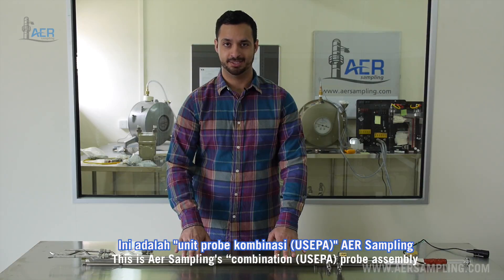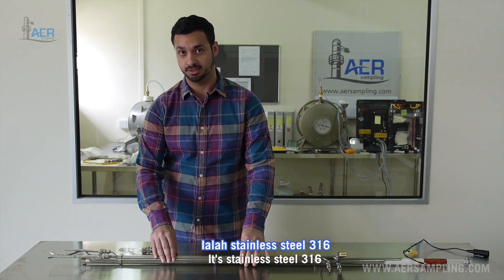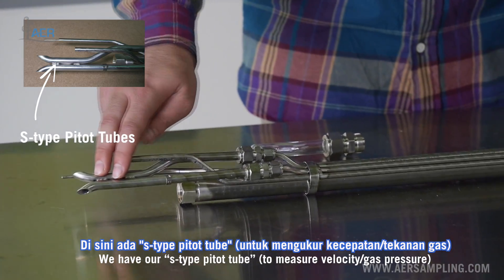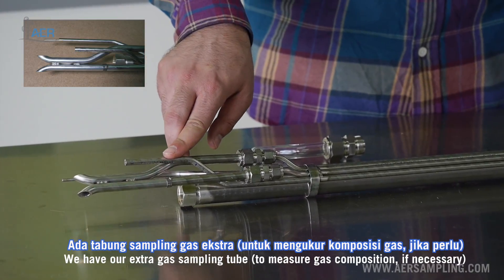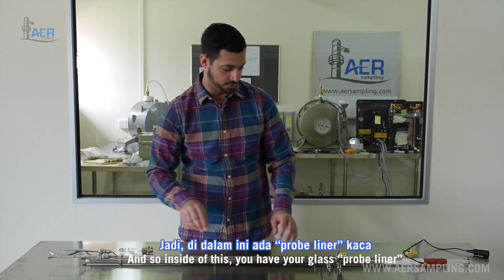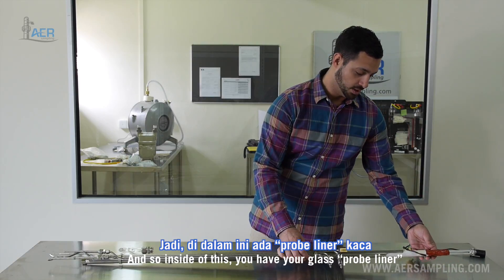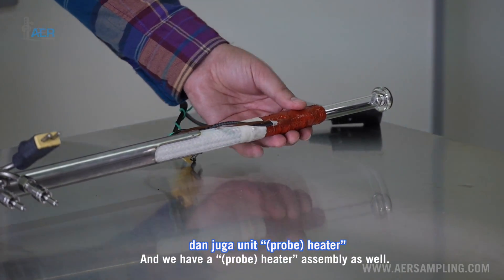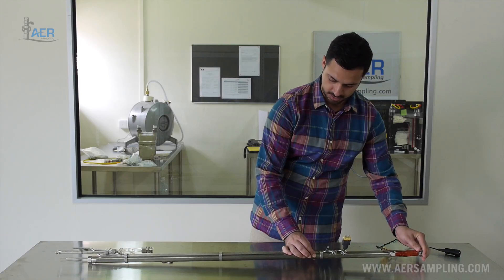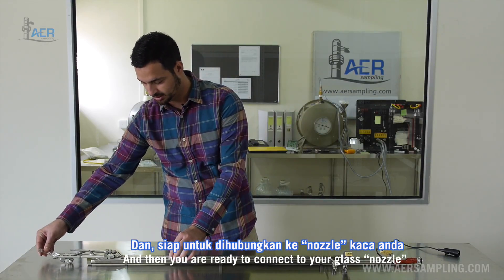This is AER Sampling's combination probe assembly — stainless steel 316. We have our S-type pitot tubes, our extra gas sampling tube, and our thermocouple. Inside of this you have your glass probe liner and a heater assembly as well. These just slide right in together, and then you're ready to connect to your glass nozzle on this end.